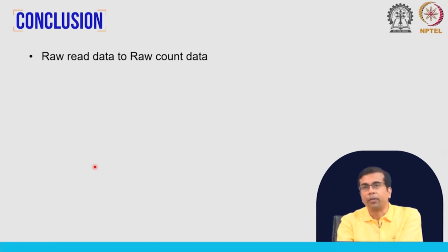We have also talked about algorithms that can account for multiple mappings of reads. This is a problem with simple tools like HTSeq-count or the other tool that we just discussed: they cannot decide whether a read comes from a specific isoform or is just counted as a gene. This can be a problem where isoform expression is of interest in your experiment.